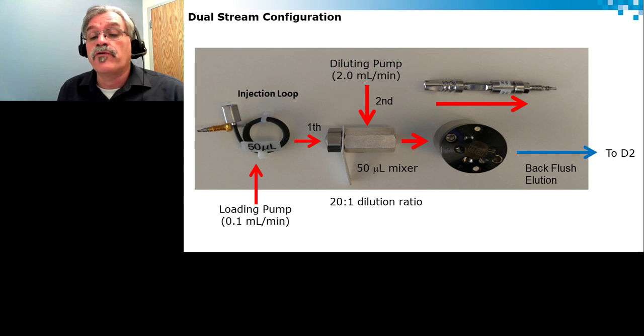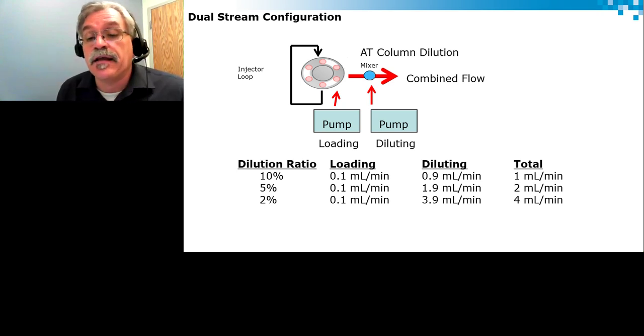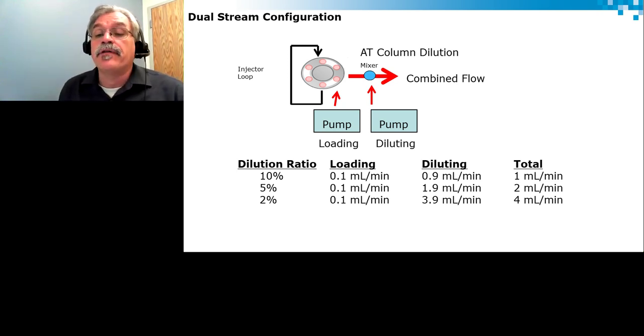But before the extract reaches the column, it will be diluted to a ratio of about 20:1. That means that by manipulating, as seen in this slide, I now have a second pump. That's actually where the complexity perception resides. Where do I put those pumps and how many pumps can I actually control? This actually depends on software.